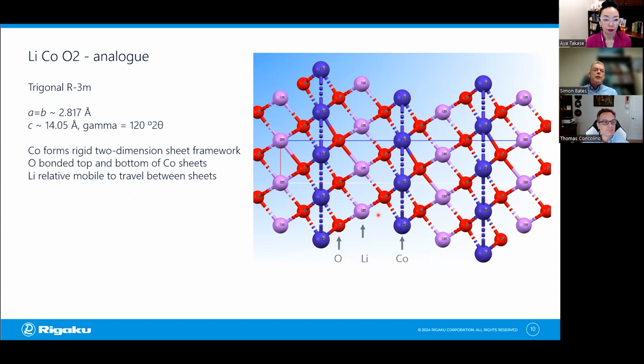But for me, the most important or characteristic features are, number one, we have these cobalt layers, these metallic layers, and in NMC, of course, that would be the nickel manganese cobalt layers. And these have a hexagonal, honeycomb symmetry, and they form two-dimensional sheets that give the rigid structure to the battery itself. So in these plots I'll show you of the atomistic level, cobalt is the darker color one, this darker purple or darker blue color.